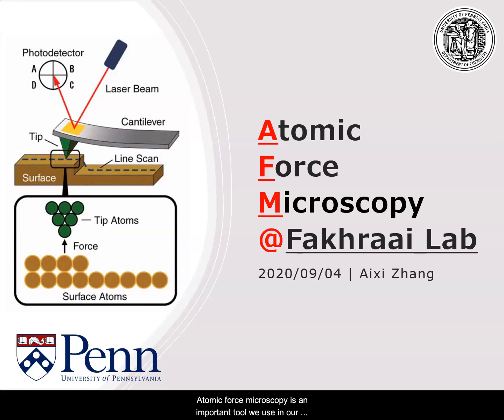Atomic force microscopy is an important tool we use in our research. Fakhraai Lab is equipped with two AFMs. Because of its high resolution and convenience to use, AFM becomes very handy when we want to check the surface status of our sample. Also, there is great science performed using AFM. In this video, I'm going to talk a little bit on how AFM works and introduce several research projects completed by AFM.